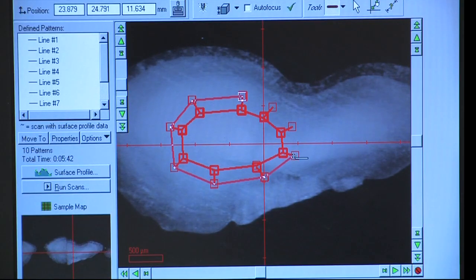Once done, connect the endpoints of the lines to obtain a new line out from the sample. This will be the path the drill follows and will account for the width of the drill bit so that no sample material is lost.